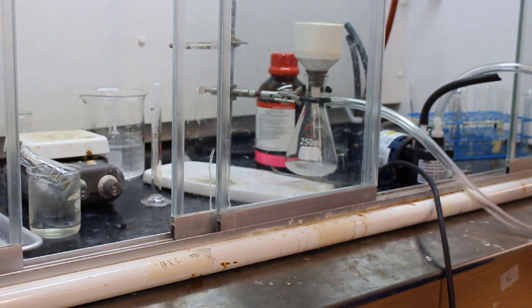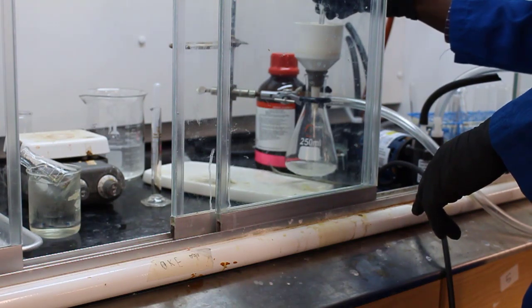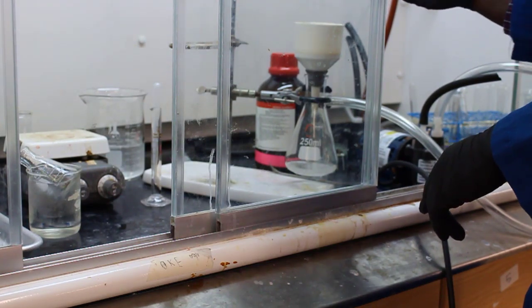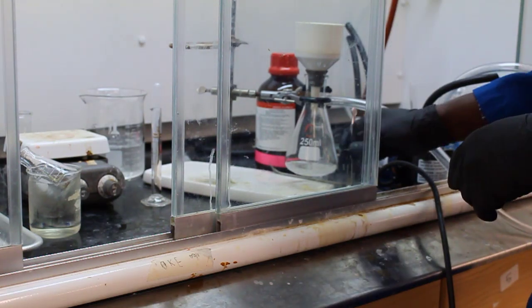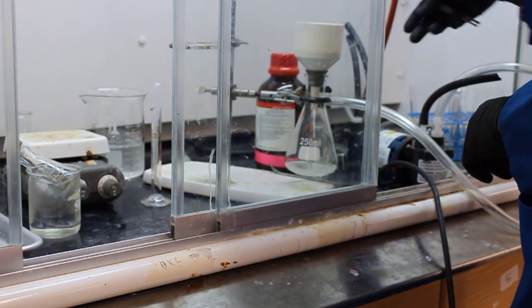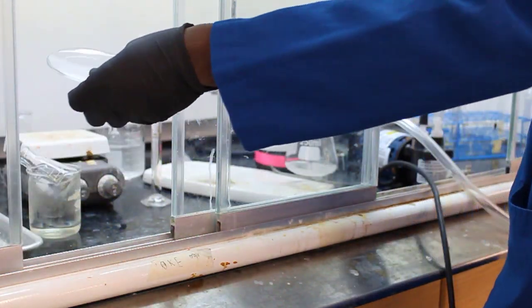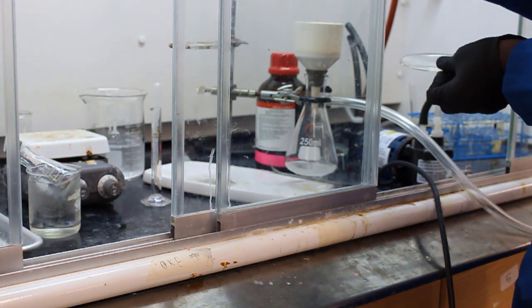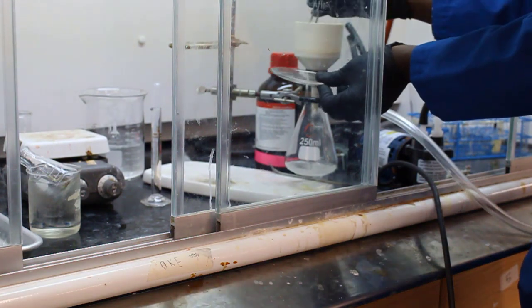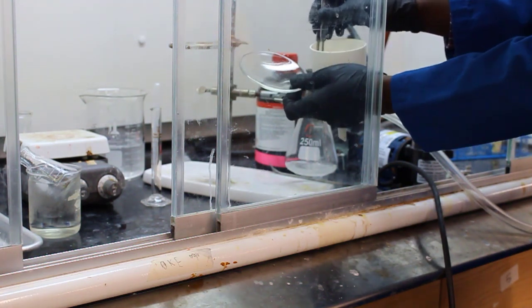Once the vacuum filtration system has run for a minute or two — maybe five minutes — they pull out the filter paper with the product on it and place it back on the watch glass to dry on the hot plate. Be careful not to burn anything — you can burn the filter paper if the heat is cranked too high.